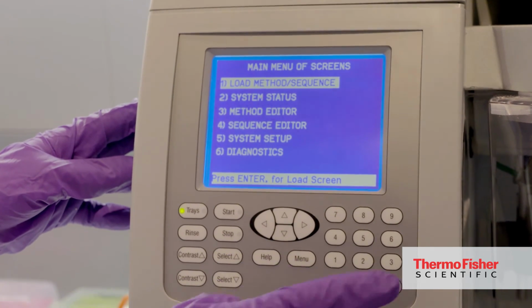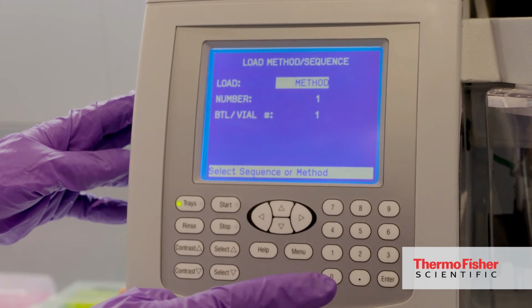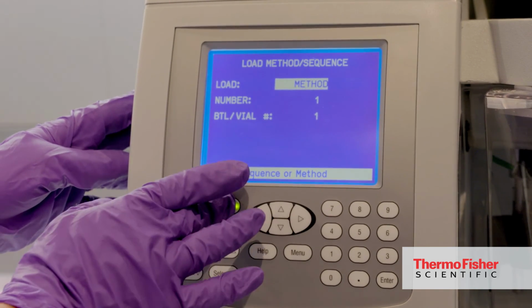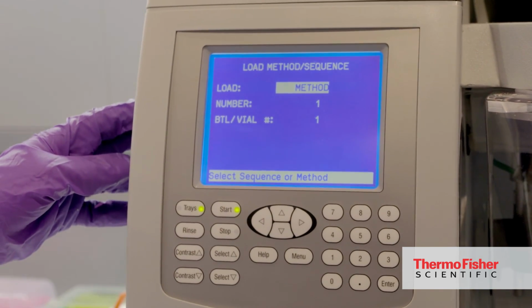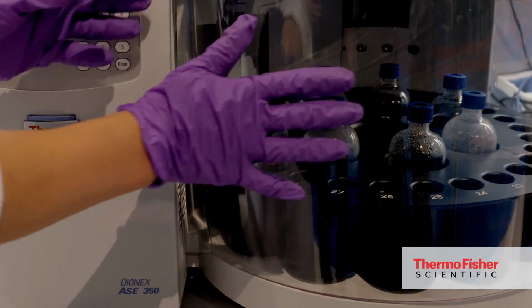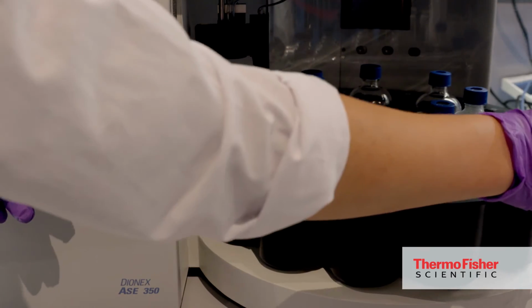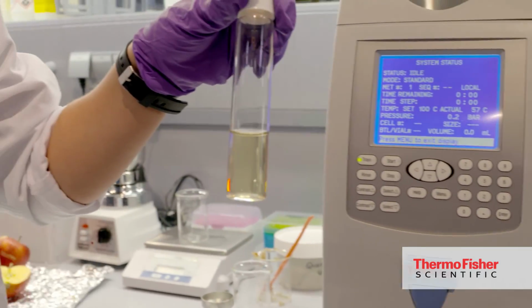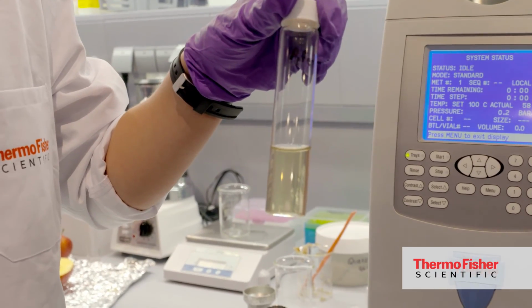Whenever it's ready, then we simply need to program the method and start actually the ready method by clicking on the start button. So whenever the extraction is finished, you just simply remove the vial with the extract, which is ready to analyze or for further preparation steps.